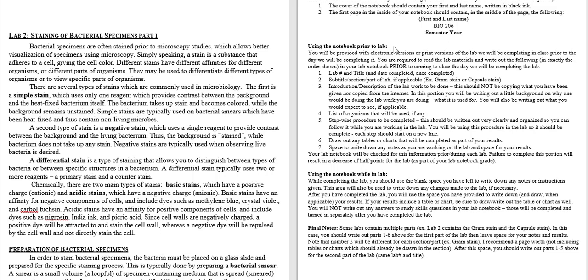You will not be allowed to have any other devices, any other papers, anything other than your lab notebook and a pen. So it's important that you have all of the procedures written down that you may need going into your unknown. So that's why this is incredibly important. Also, just week to week, your lab notebook is what you will be using when you're doing your actual labs. So in the actual lab room for Lab 2, for example, you'll be following in your lab notebook, and you'll need to know what to expect and how to do that. So let's get into it.